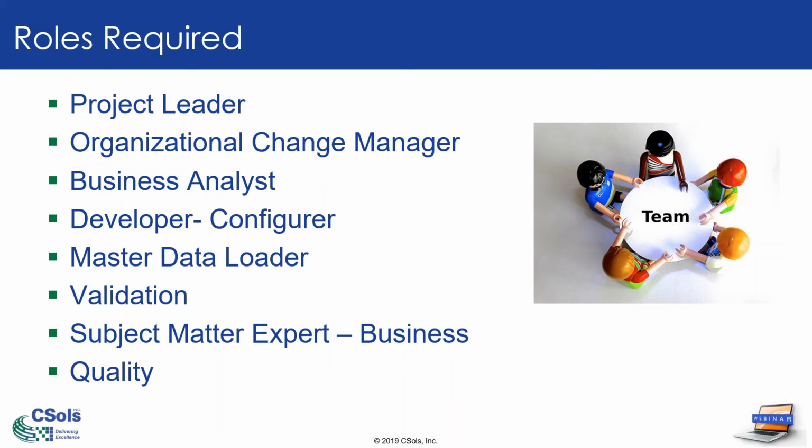In the regulated fields, you're going to need somebody who's going to be your key contributor from a validation standpoint. And then in addition to that, you're going to need subject matter experts within your business, and I'm going to speak to that as well. And of course, you need to bring quality in. Quality a lot of times is your final signatory, and it needs to be addressed in these projects.